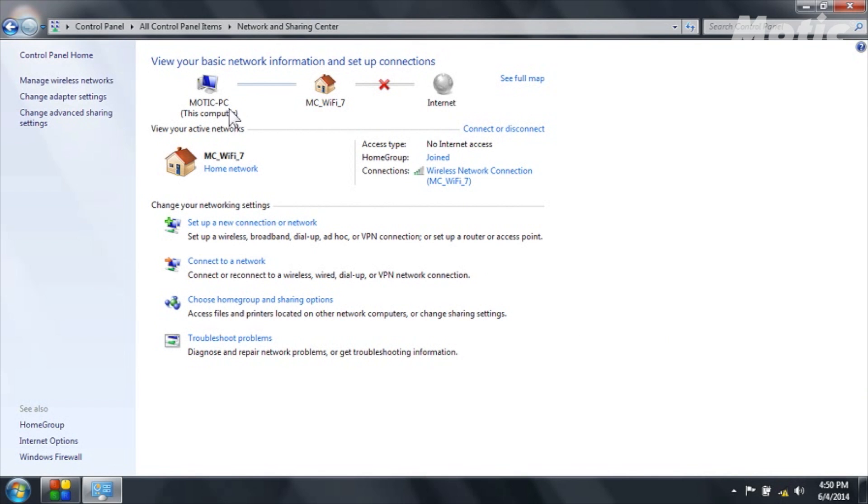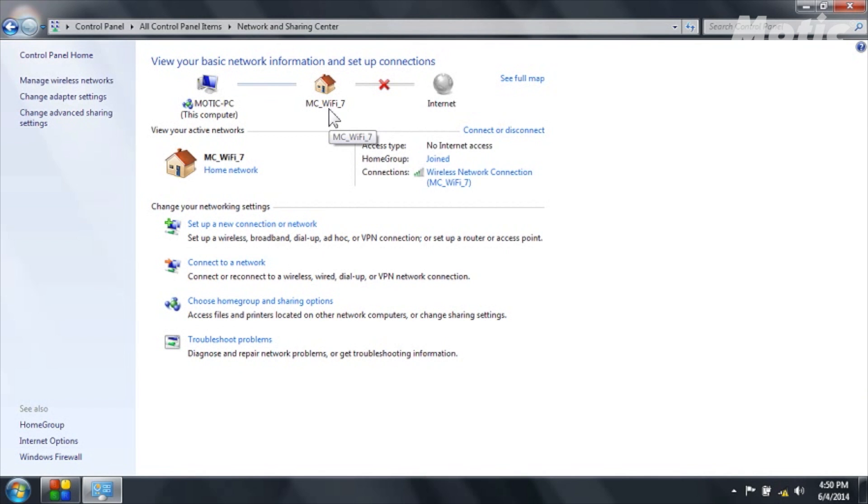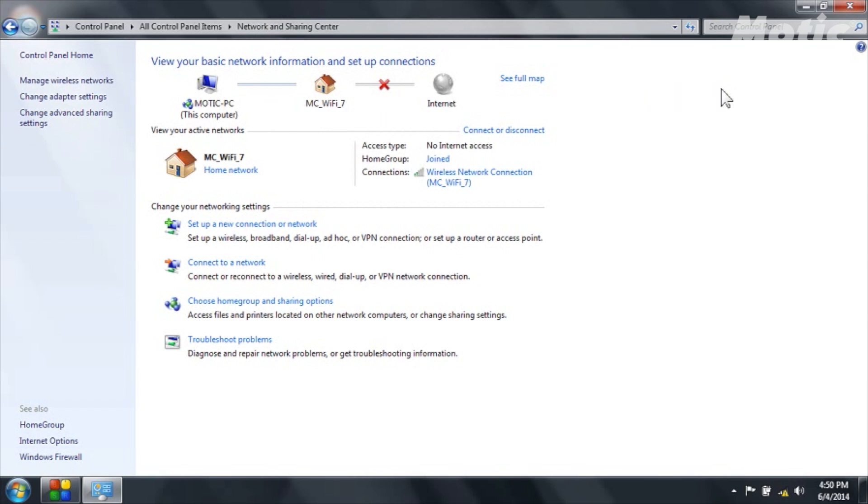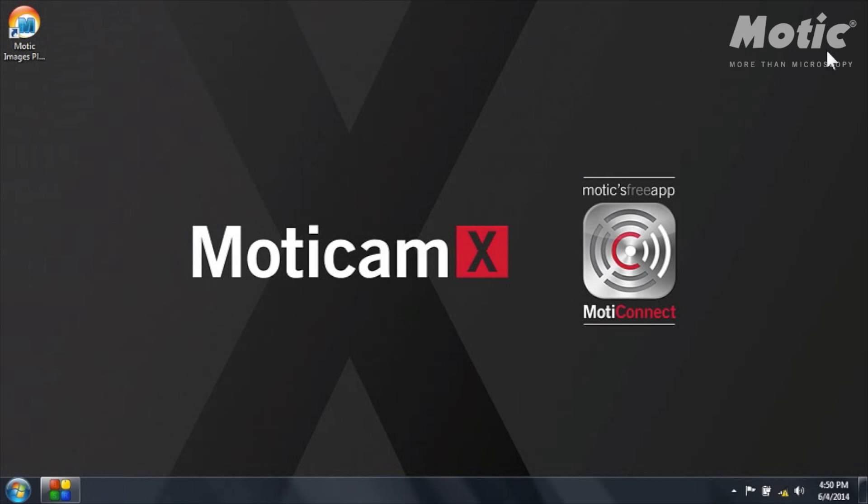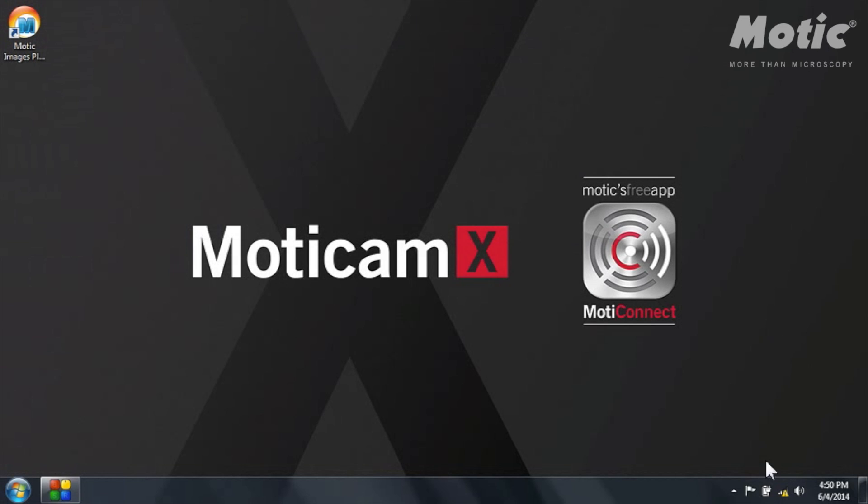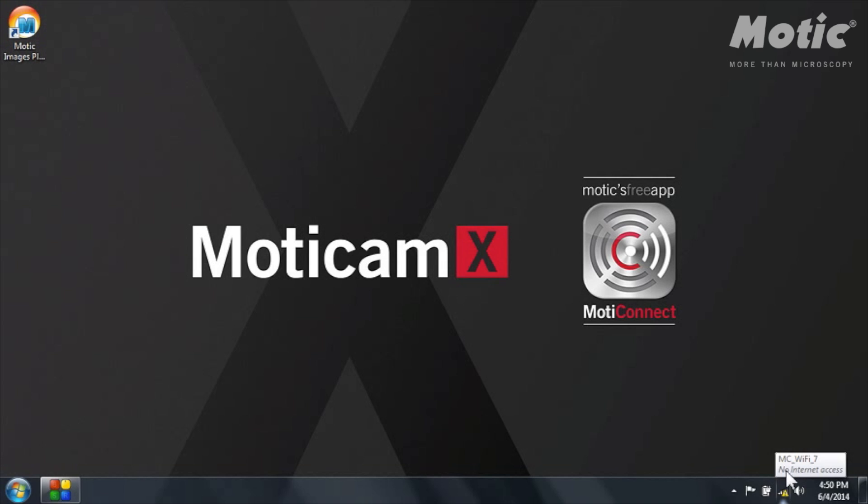You can see here Modicam PC is connected to MC Wi-Fi 7. However no internet access and this is completely normal since I am connected to the internal network of the camera and I am not connected to the internet. You will also see on the toolbar this warning sign saying no internet access. This is normal.